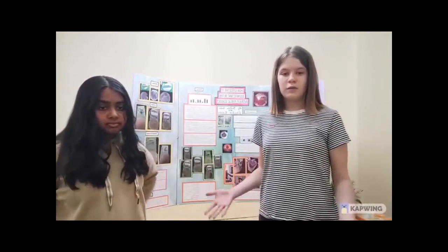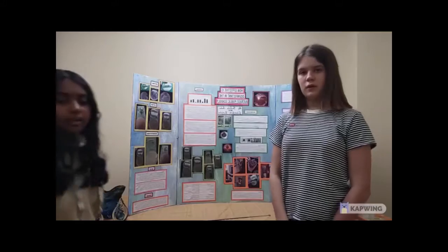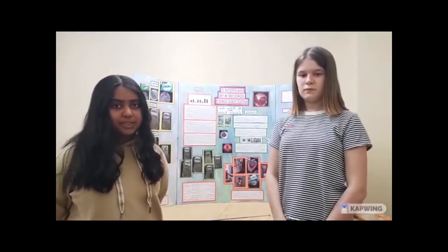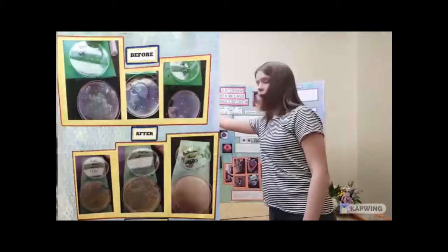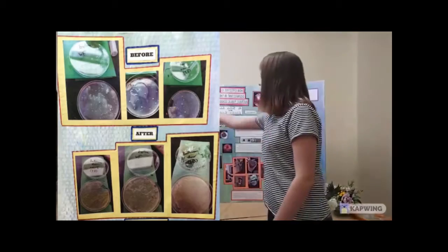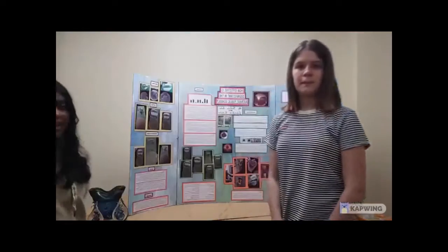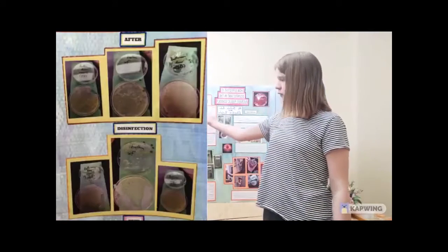So these 3 pictures were shot before the swabbing process had been complete. As you can see, it says before. We chose these 3 because they were the most successful tests. As you can see, there was a great difference between before and after. Before means before swabbed, and after means after swabbed and incubated. And disinfection, over here, means after we disinfected the petri dishes. Unfortunately, there wasn't a great difference between after incubation and after disinfection.